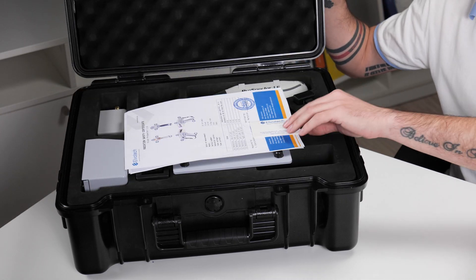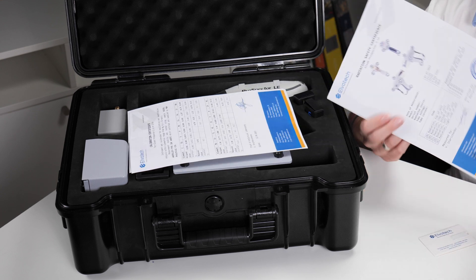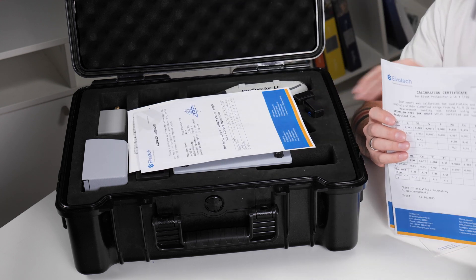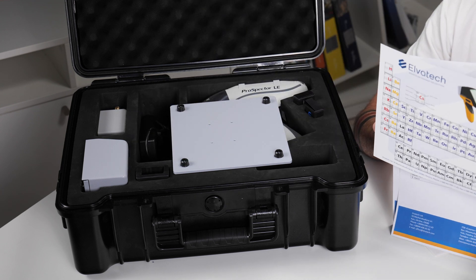Let's start by opening the analyzer's box to see what's inside. Every analyzer comes with a special card on which you can find the user's manual, a radiation safety certificate, a calibration certificate which comes in two sheets, and also a special periodic table from Elvatec.